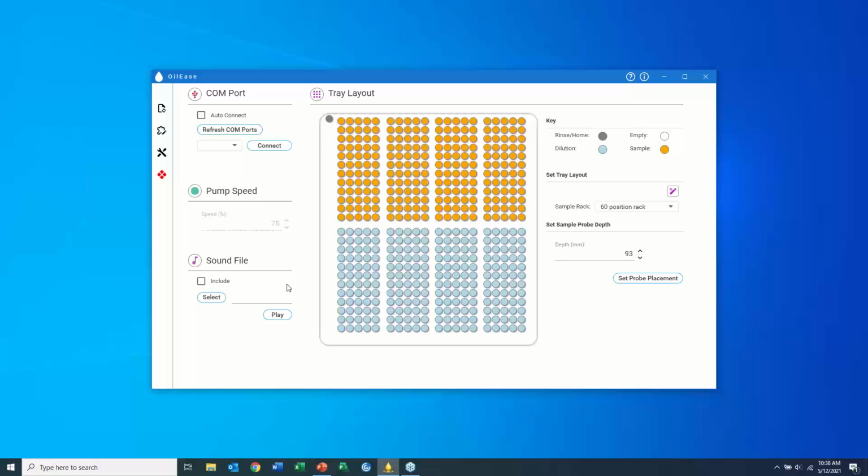What it'll do is once your dilutions are complete, it'll play you a song to let you know you're across the room or whatever. Hey, this is your notification that this is done. So you should come over and move your samples onto the ICP. They're ready to go to the next step. So that can be a really nice option, and you can customize it to fit the feel and needs of your laboratory, or you can decide not to use it, basically.